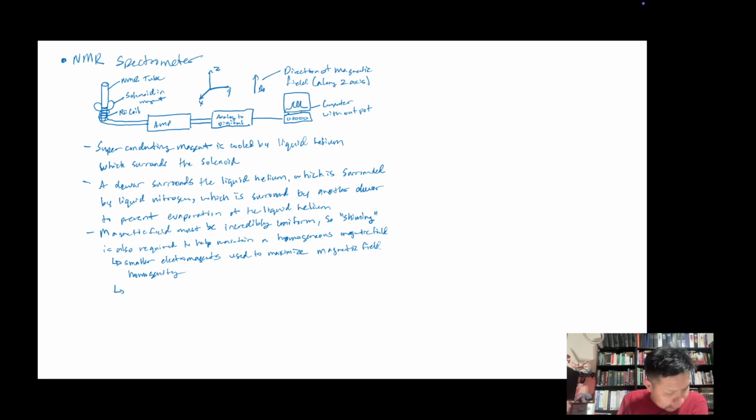So how does it do it? Well, it adjusts the magnetic field in the z-axis, x-axis, and the y-axis.